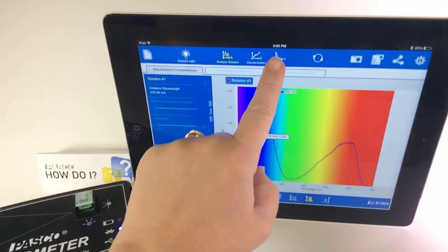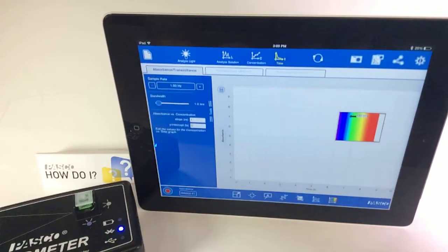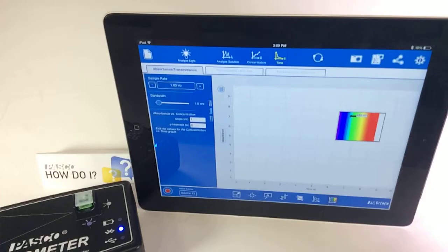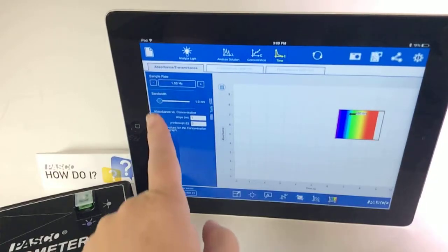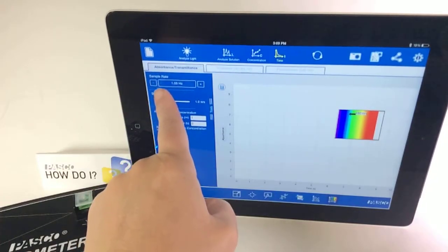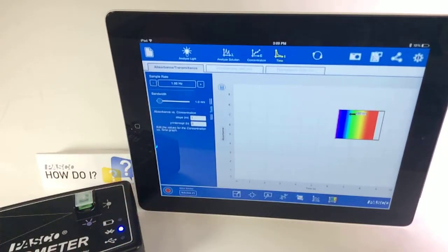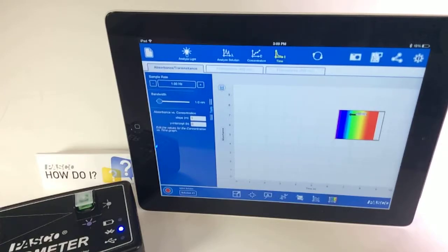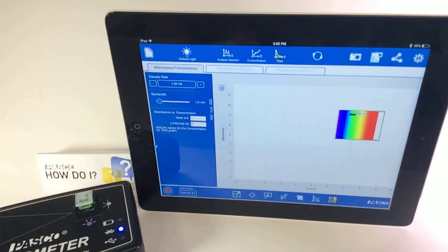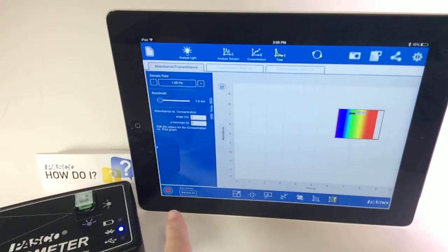So then I can switch to analyze a reaction over time, and I can change the sample rate depending on the relative speed of the reaction. I can make it collect a data point every second, every minute. I can change that sample rate.